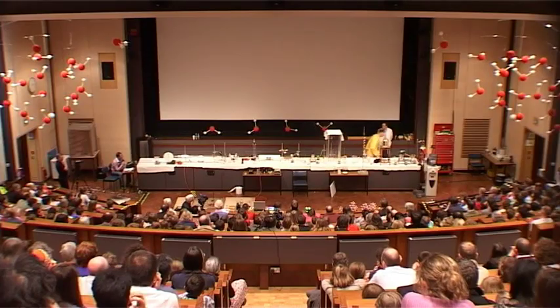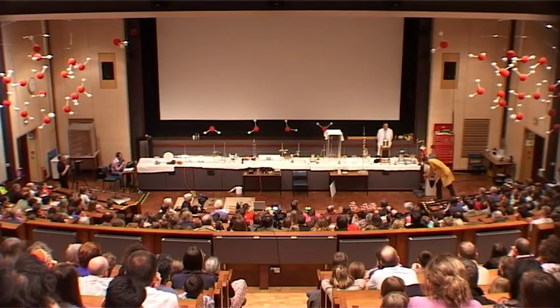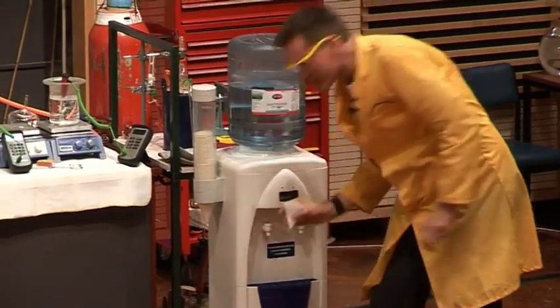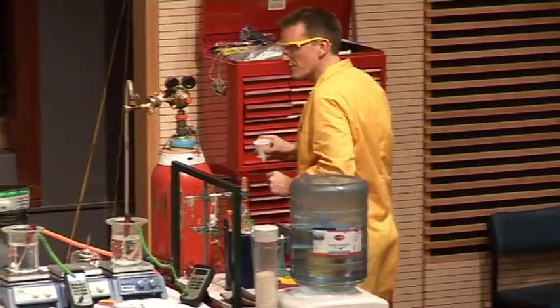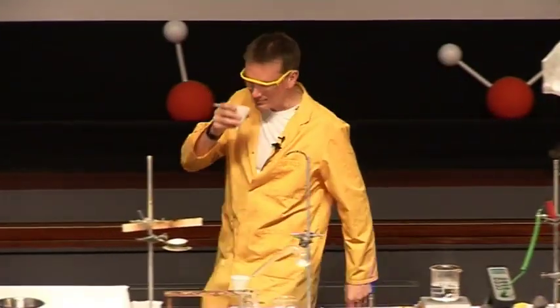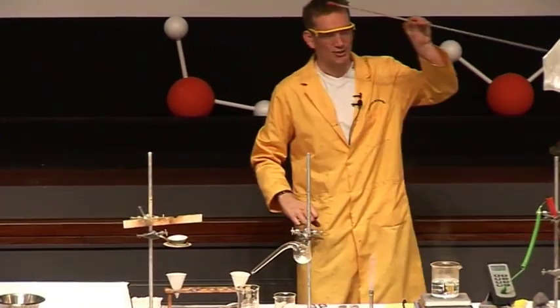So I need some water. Just come around here to the water dispenser, get some water. So it really is just normal tap water. Actually, I'm sure it isn't tap water. It's very nice mineral water, of course. Yes. Okay, and now I have my long pipette, my special long pipette.